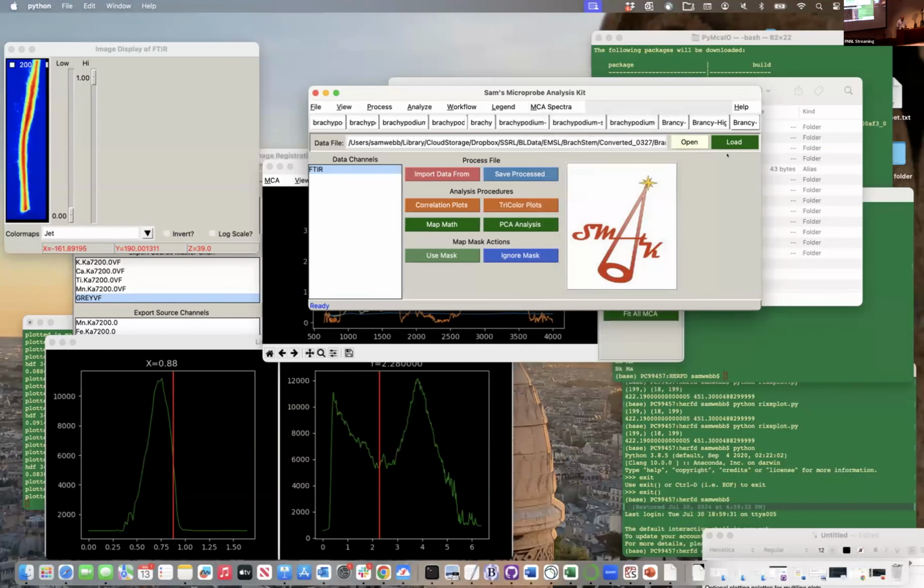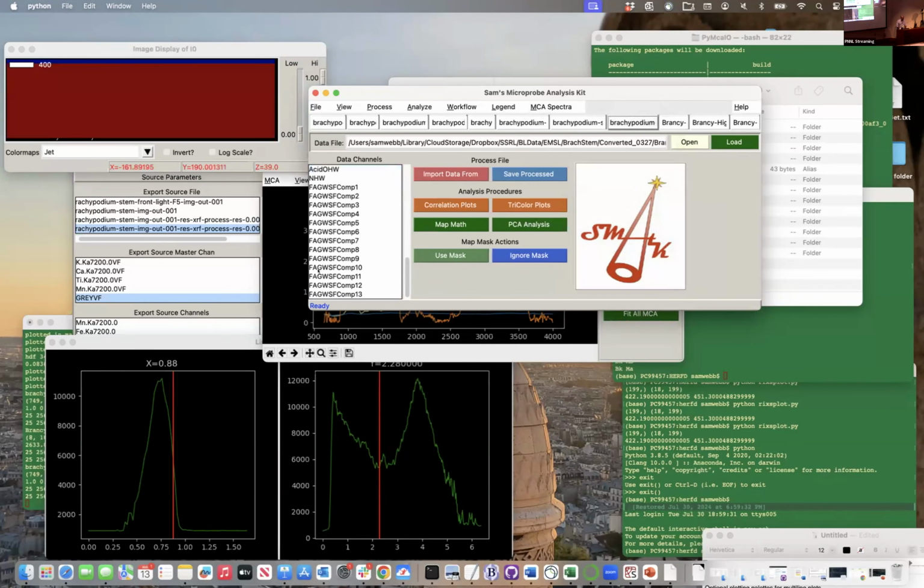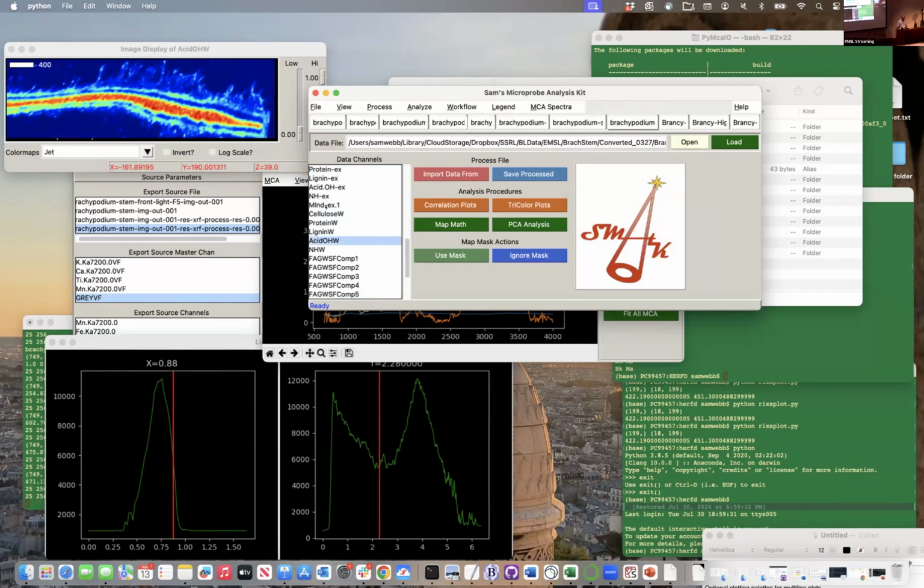Now, I'm going to go back to this data set here, this one here, no, this one here. So this has our merge of data. We do now different processes to this. I can take these data and compare them.